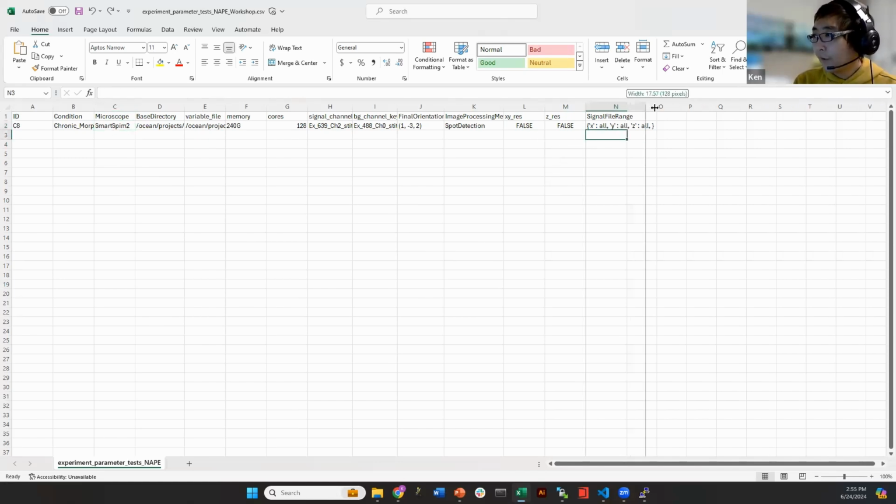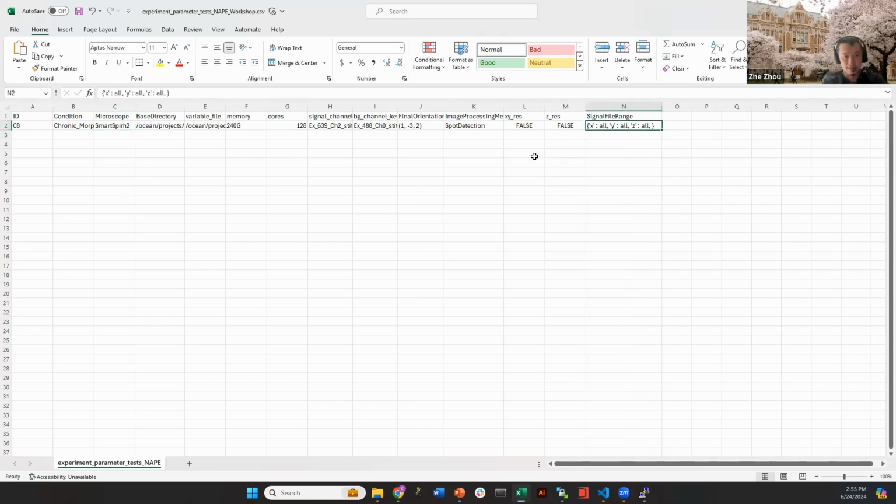Do you have any models for projection, or is it only spot detection right now that's working? Spot detection, no, that's a totally different thing. Anything projection will use something totally different. Okay, cool. It's not in the same package.